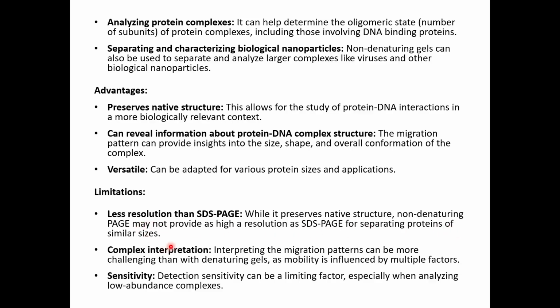Because it is not denatured, similar-size proteins might not be differentiated. If the sizes are too close, they might appear as a single band even though they are two different proteins. This does not happen in denaturing gels like SDS. So this is one of the limitations.